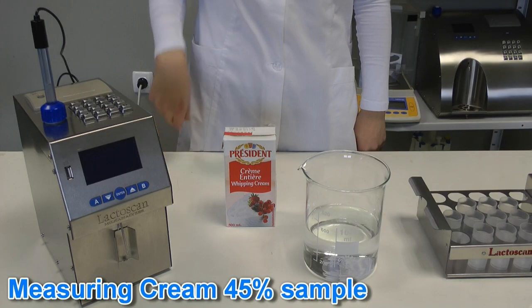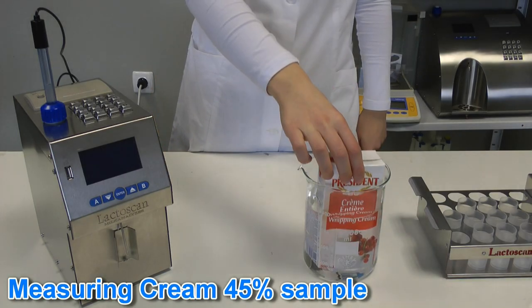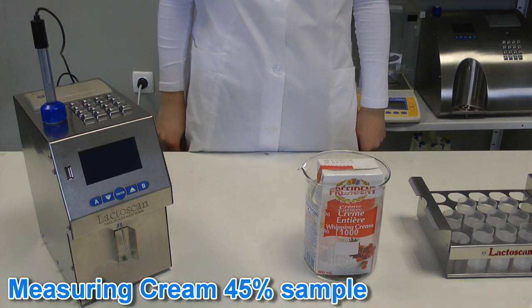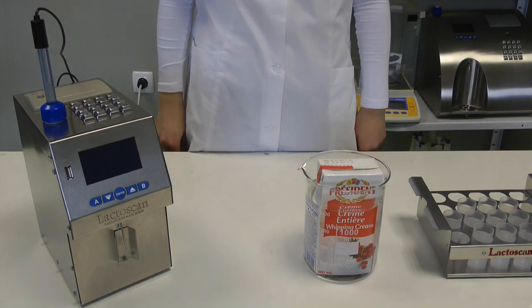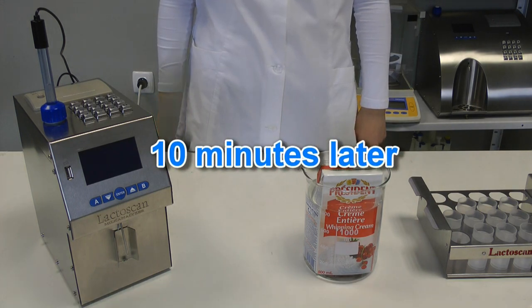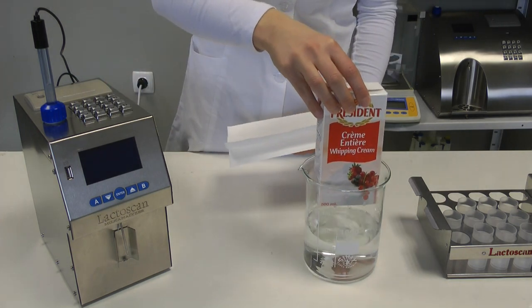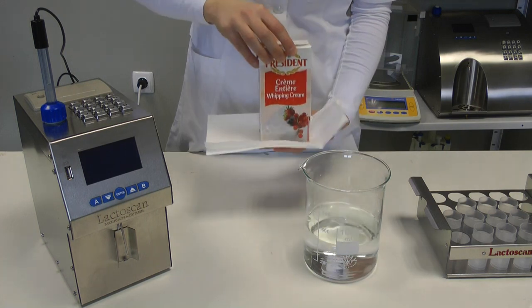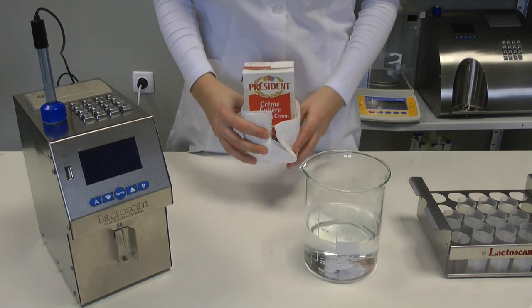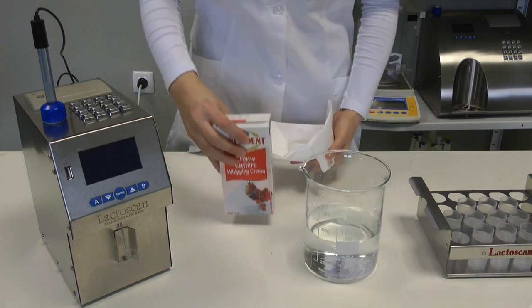For calibration with cream 45%, take the cream sample, put it in vessel with warm water for about 10 minutes, shake it carefully, and use it for measurement. Please pay attention that the analyzer needs cleaning after cream measurement.